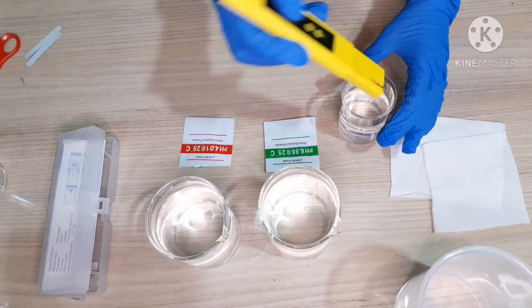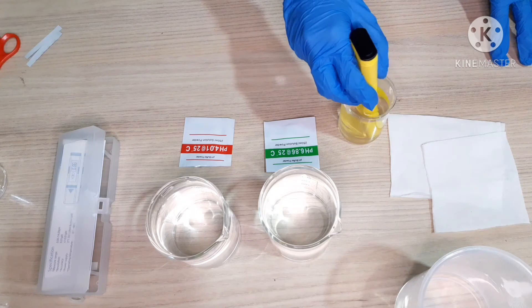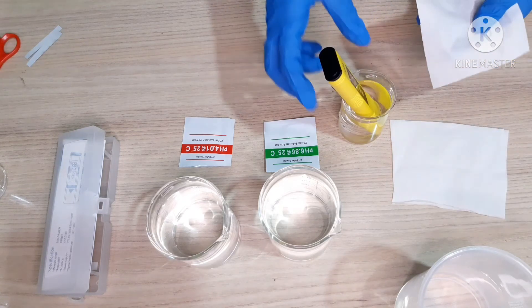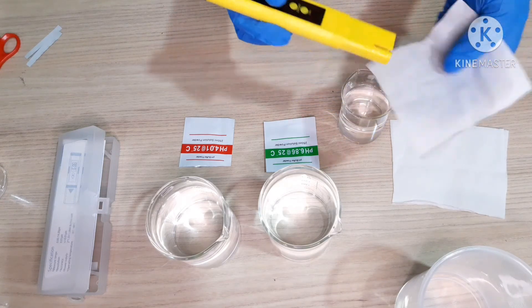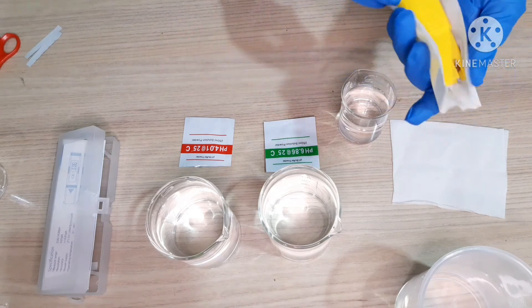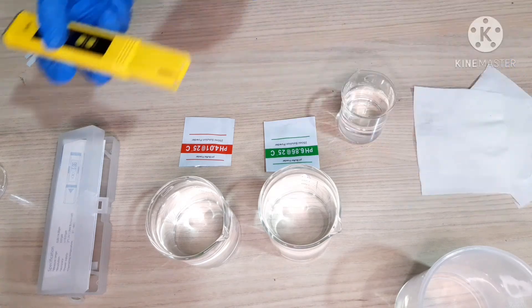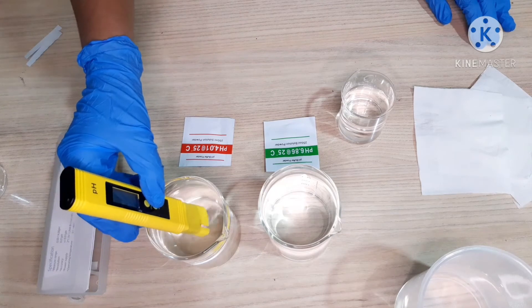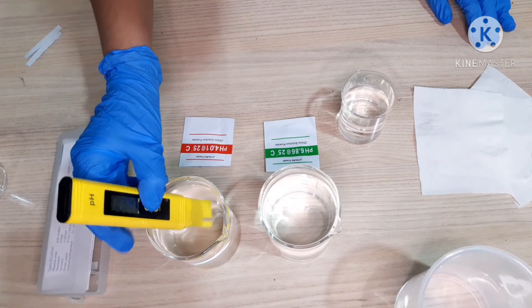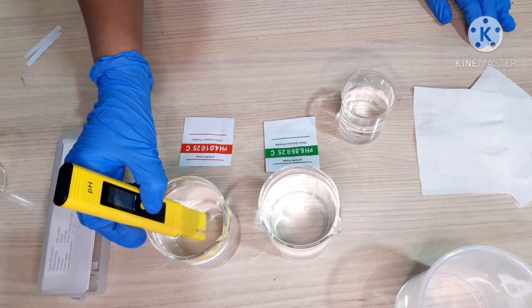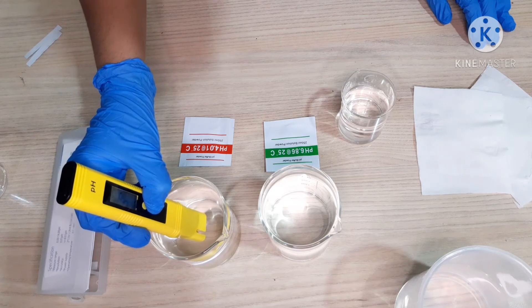I will again rinse it in distilled water. Now, I will put the pH meter in pH 4 solution. Turn it on. And now, I will press calibrate for 5 seconds.